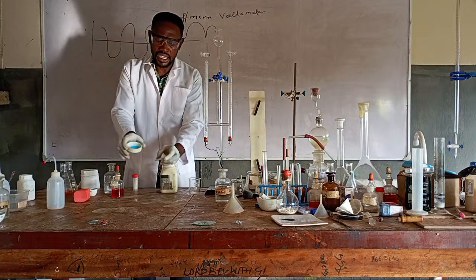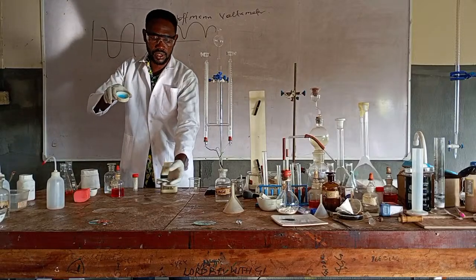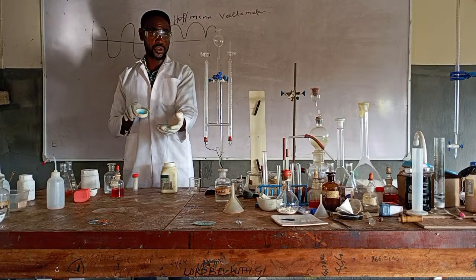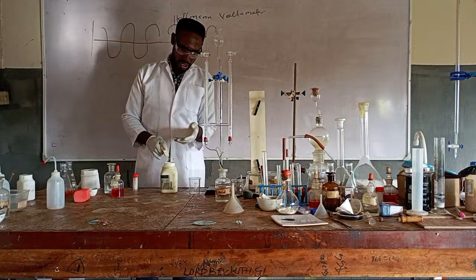If you look at this, if you can come close, you see this one is crystalline, this is hydrated, but this is just like ordinary powder. Am I communicating? Yes. So the anhydrous is not crystalline, although under the microscope it still has some crystalline shape. So we can say that the anhydrous is non-crystalline.